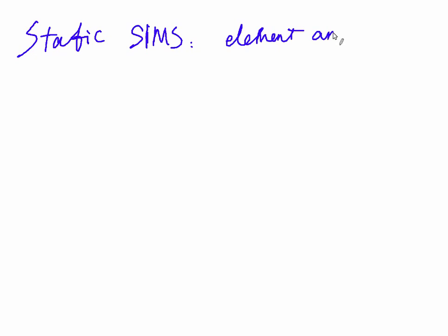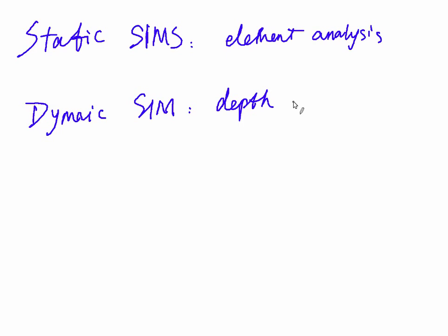We mentioned that there are two modes for SIMS testing. One is static mode. This static mode is used to do some element analysis. The dynamic mode is used for depth profiling, which can generate a 3D signal.